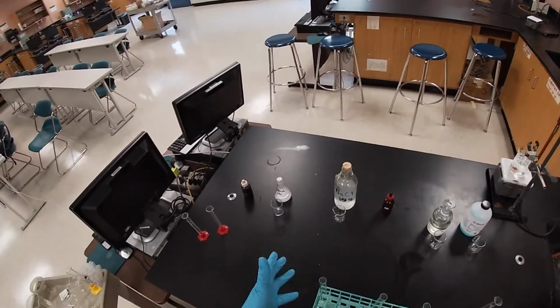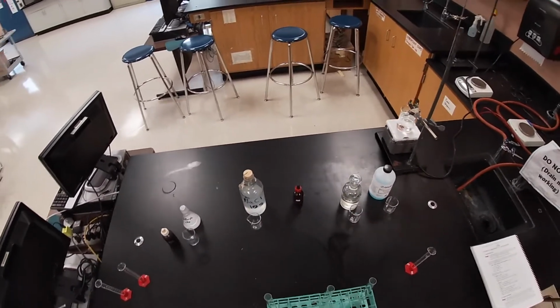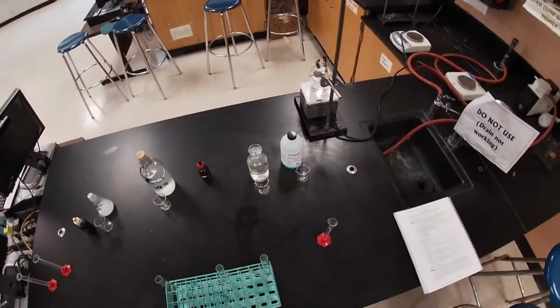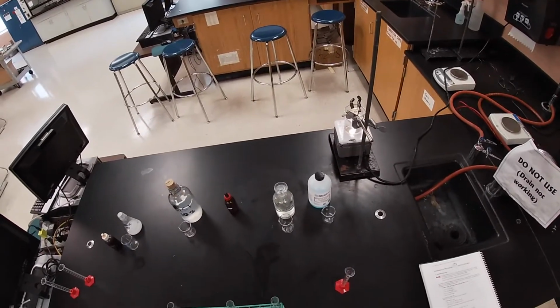substances. So if we're looking for starches, we're going to use iodine. If we're looking for the chloride ion, we're going to use silver nitrate to precipitate that chloride ion out. And then for the test for sugar, for glucose, we're going to use the Benedict solution.